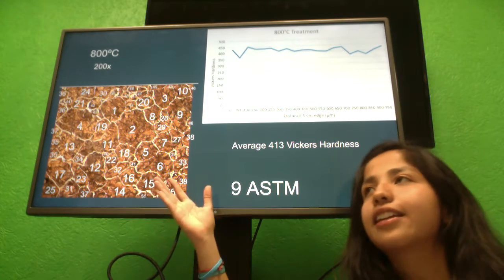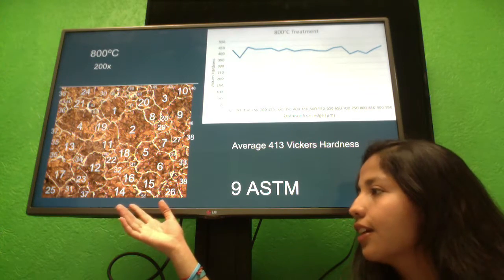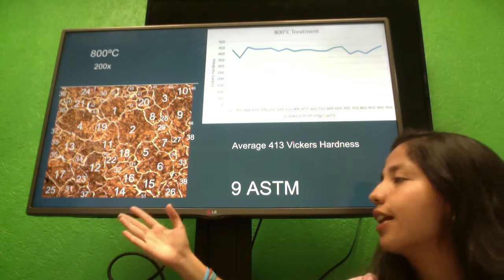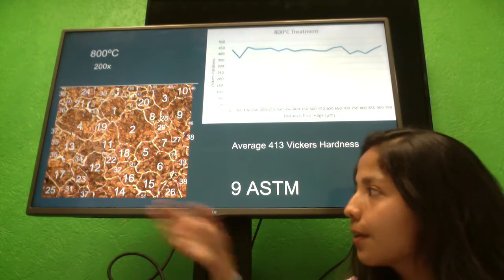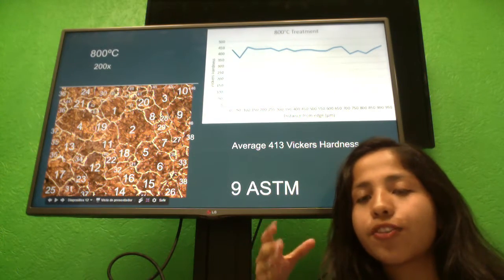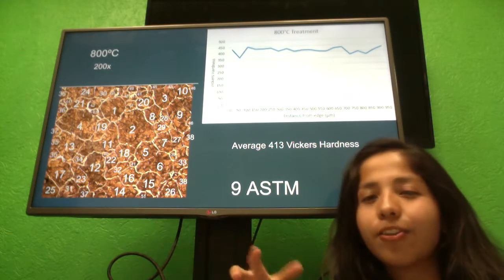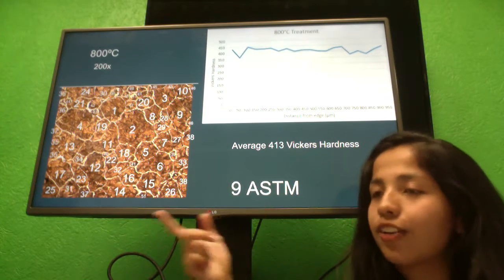We could see that here we don't have all martensite. The hardness is not too high, and the grains are not in these flat, narrow plates. This could happen because the piece was heated to 900 degrees and was left at environment temperature for about 30 minutes until the muffle reached 800 degrees.